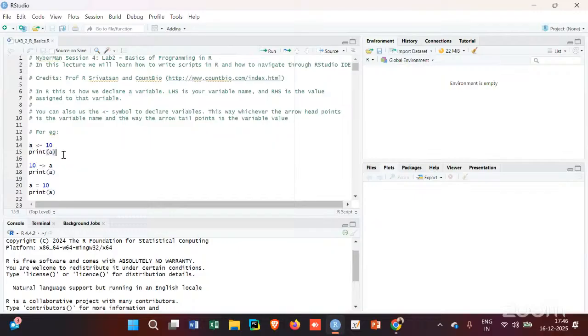In any language, there is a certain syntax, or grammar, basically. That is the rules and the way you write code in that coding language. In R, this is the syntax that you can see in front of you. I will be talking about the syntax a little bit, but syntax differs from language to language. One part of learning coding is also to learn the syntax, but that is something that comes naturally to you when you actually write your own code and keep practicing writing.